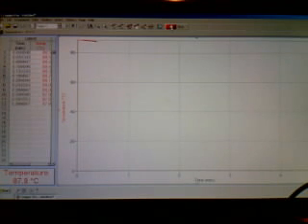on the screen. Now, as a teacher, you need to be thinking about the questions that you'll be having your students answer. It's not likely that you're going to develop a Nobel Prize in heating and cooling curves, but you never know what thinking you might be inspiring in your students for the future. So while the data is being collected, think about what you would actually do in your classroom. Would you have them speculate as to what might happen?